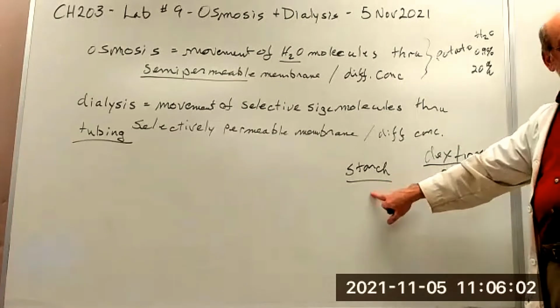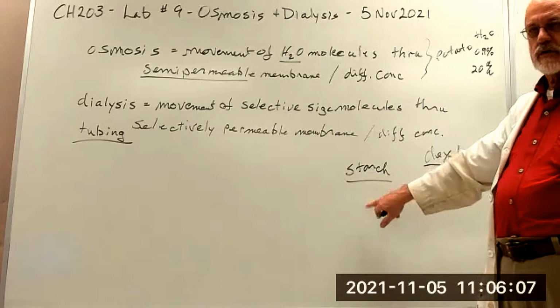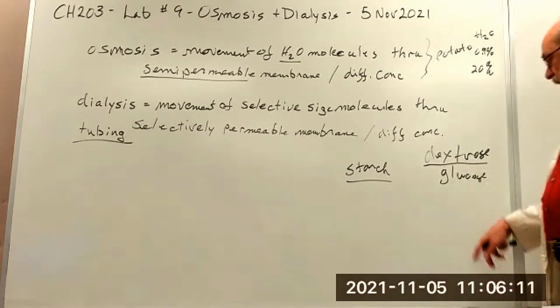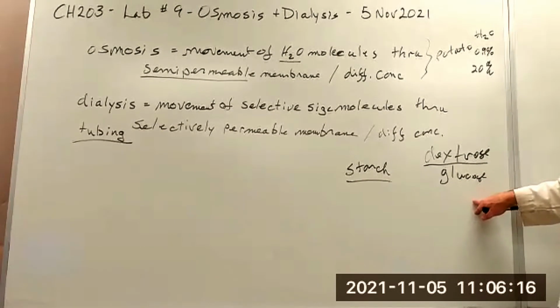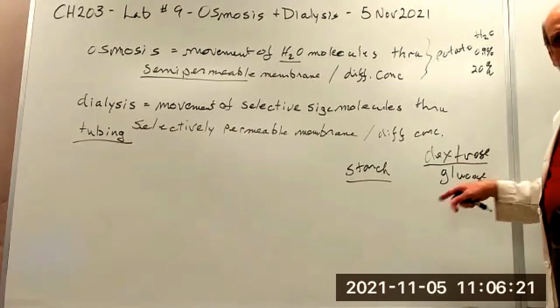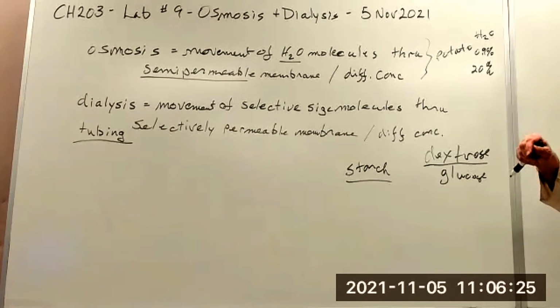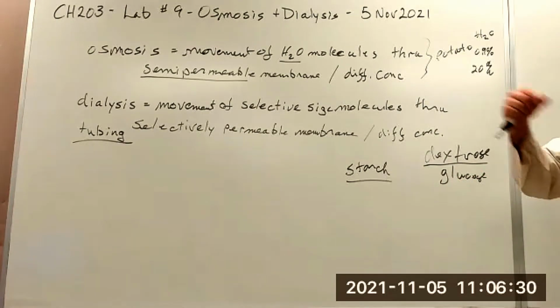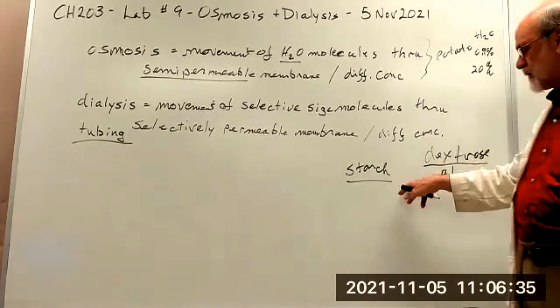And starch would test with iodine. That's a really simple test. It turns dark blue or black if the concentration is high enough. And we have a solution. The test for glucose is Benedict's solution. It's kind of a bluish color because it has copper in it. Only you have to heat this one up when you add them together. It's a qualitative test. And you test for glucose, and you have to heat it up in order to develop the color. So those are the two tests.